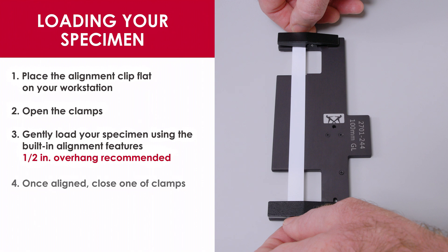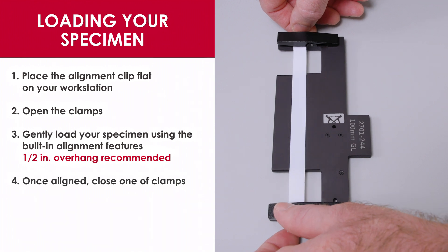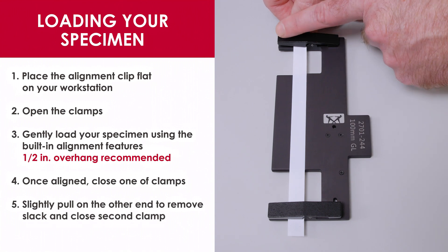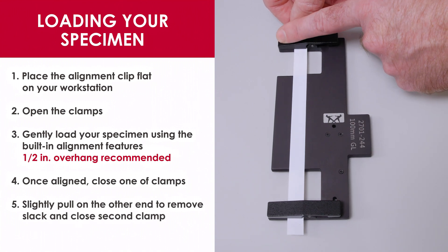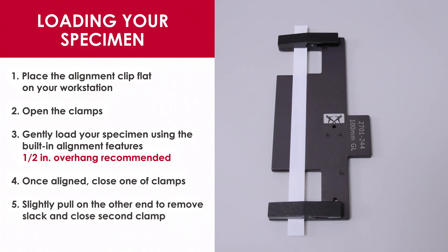Once you have the specimen aligned, close one of the clamps. Slightly pull on the other end to remove any slack, and then close the second clamp.